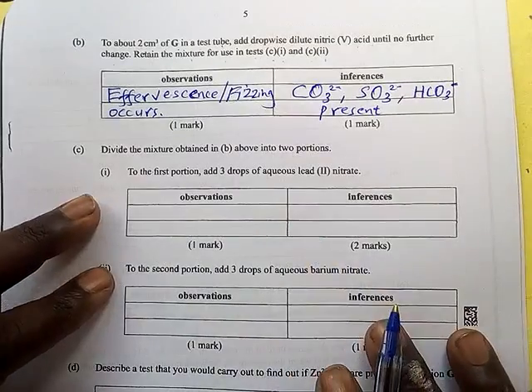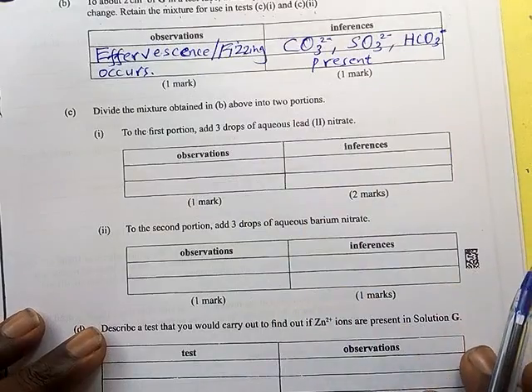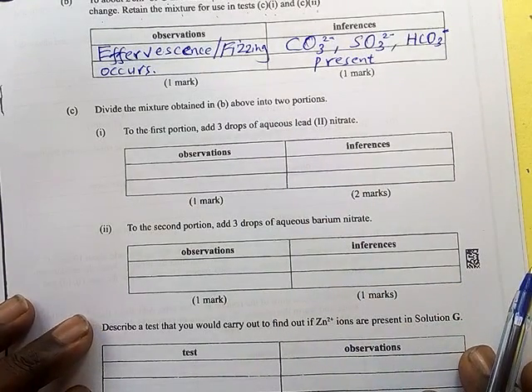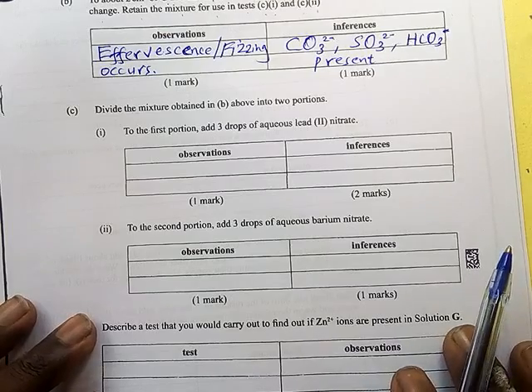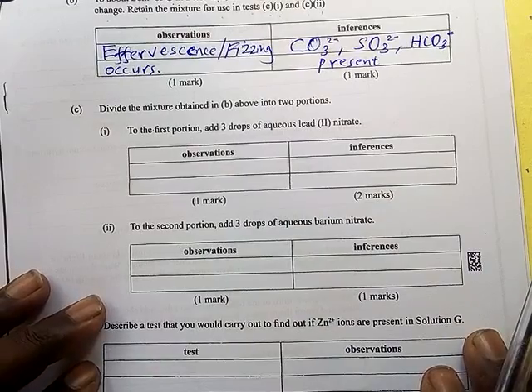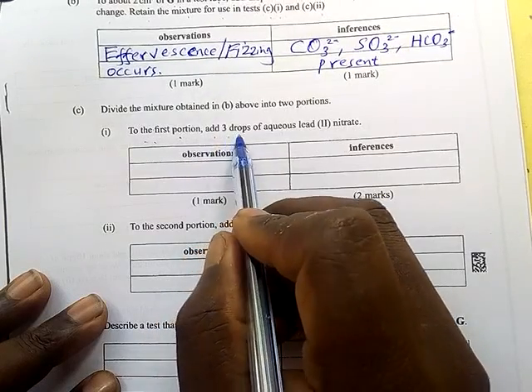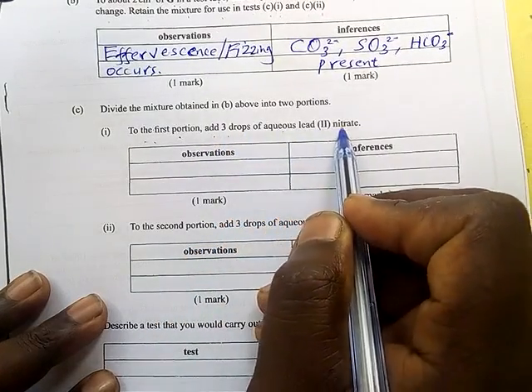Very good. Next one, divide the mixture obtained in B above. Now we have this mixture. Divide the mixture obtained above into 2 portions. We are going to divide this mixture into two portions, and then to the first portion, add 3 drops of aqueous lead nitrate.